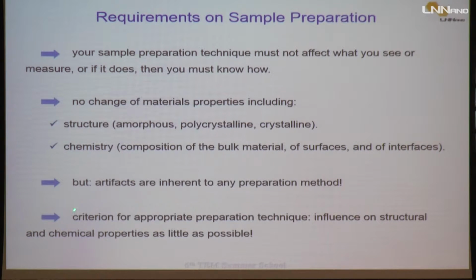Here it's very clear how the sample preparation method will introduce some artifacts in your sample. This is very important to have in your mind. All that you do will change your sample in some way. You need to be sure in which way it's changing.